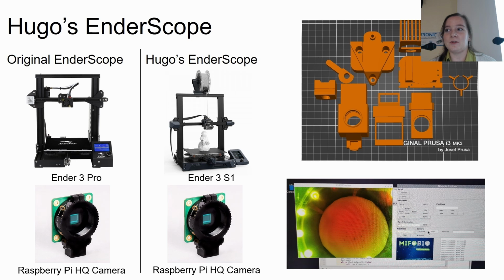And then both Jerome and Hugo made some quality of life improvements to the interface as well to make it easier to use. And there's an even better version of the interface in the demo outside as well. So there's some really interesting modifications being made where researchers are taking this instrument and modifying it for their specific experiment.